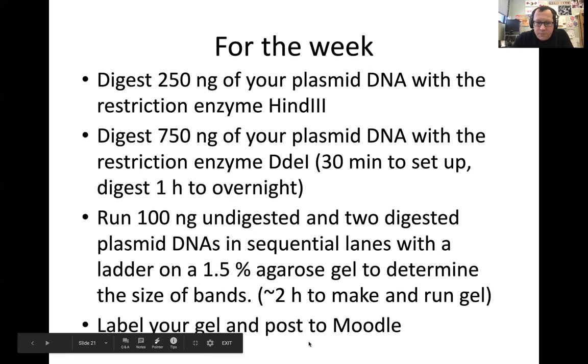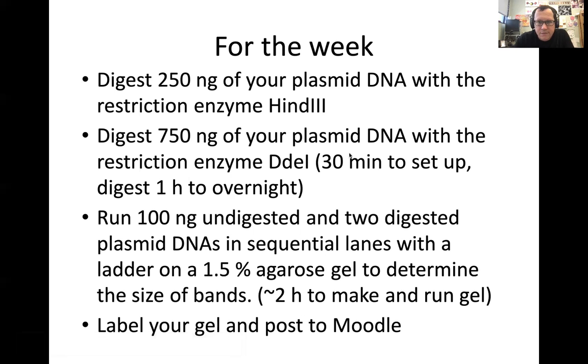So then you're going to take your gel, take a picture of it in our gel doc, and then label it up, and then post it to Moodle up on our class forum.